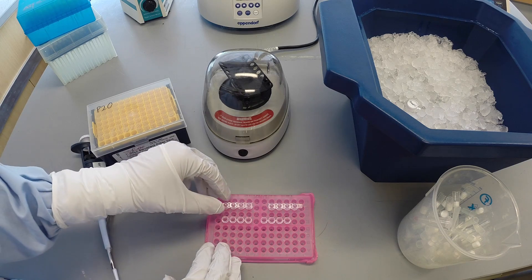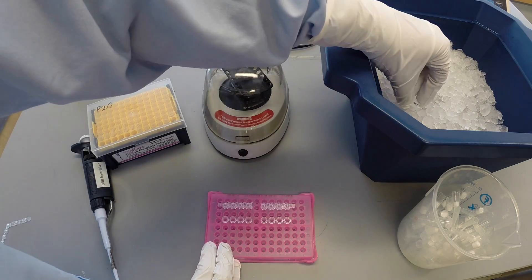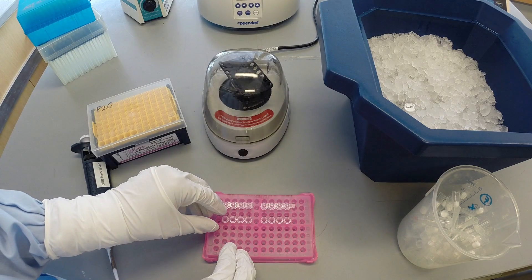First, the amplified samples are needed, including the negative control. The appropriate restriction enzyme is also needed. In this case, the variant being studied in the OXTR gene demonstrates alternative digestion by BAMH1. Enzymes must stay on ice at all times or they may lose their cutting activity.